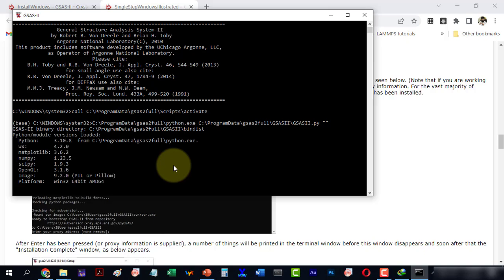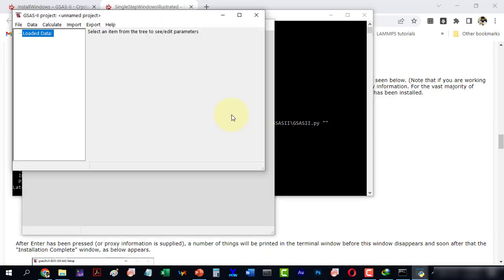It shows all the packages. Here we have the software interface. This is the data tree where we can check the version of GSAS.